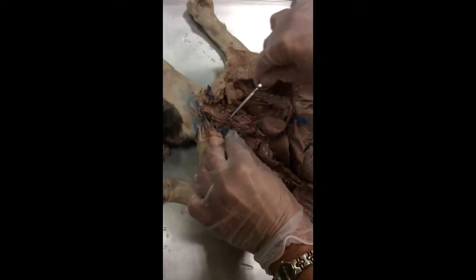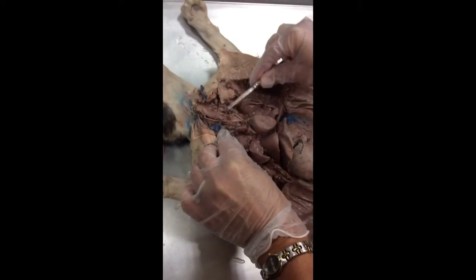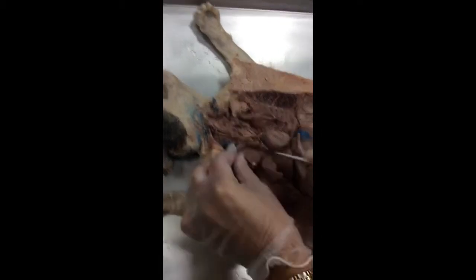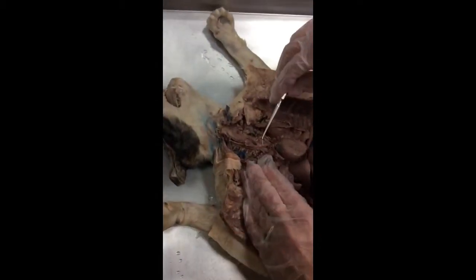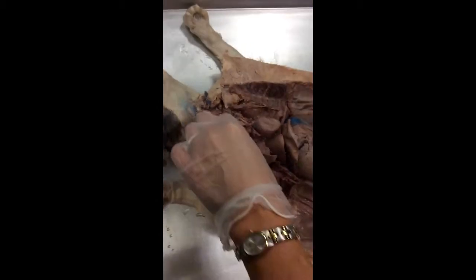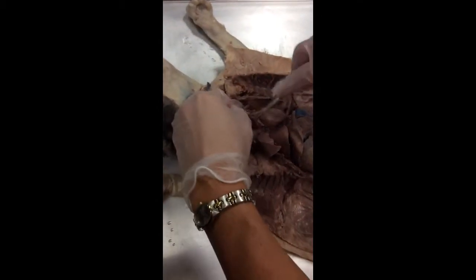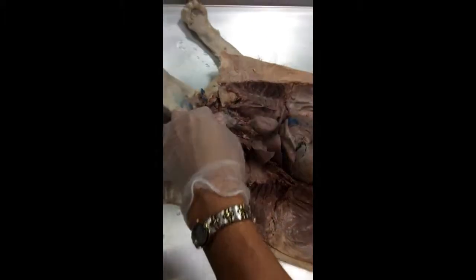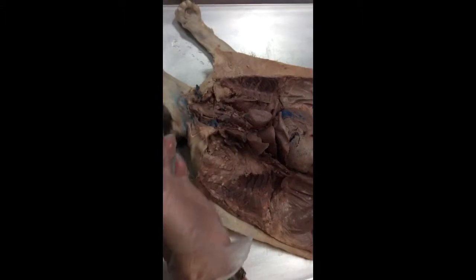And it'll go up and branch. They have the right common carotid. The left one was cut. The other subclavian is over here. So the big one is a brachiocephalic. Yeah. And the smaller one, the left carotid? Is the left subclavian. Subclavian, sorry. And then, if you see this nice and clear, what is this big vessel? Superior vena cava. Right. Blue vein going into the heart, superior vena cava.